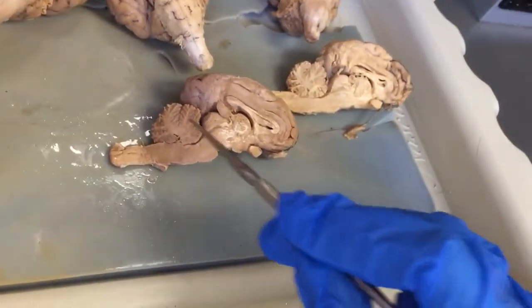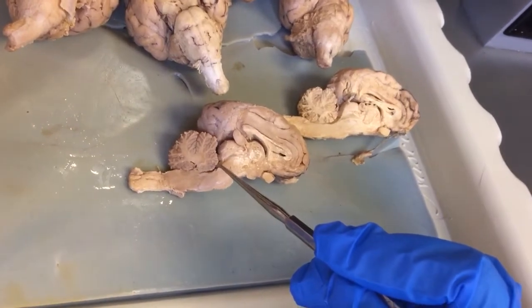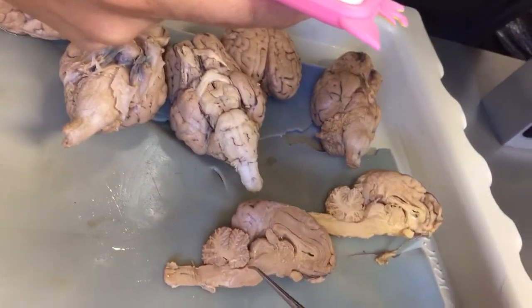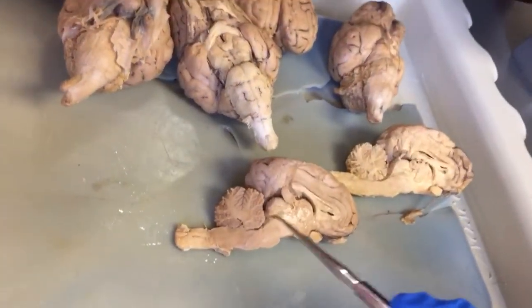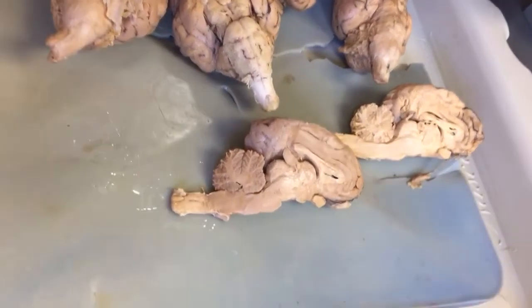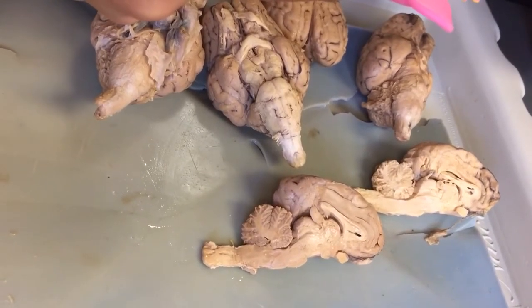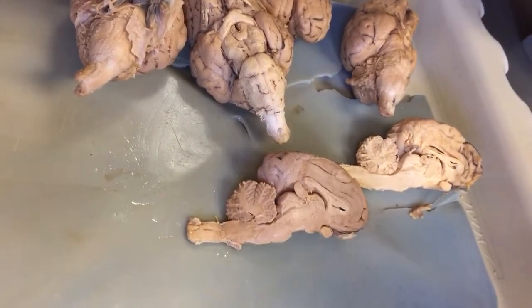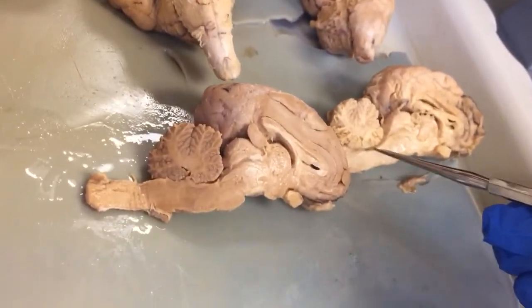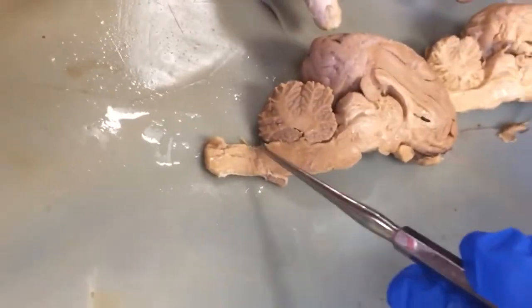Does the other space have a name? I thought it did. The posterior colliculus is the bump. Maybe it doesn't have a name. It's not labeled in either of these figures. So this is the fourth ventricle here. Sorry, I was using this one. Fourth ventricle here.